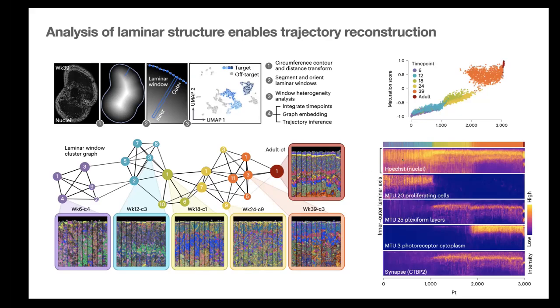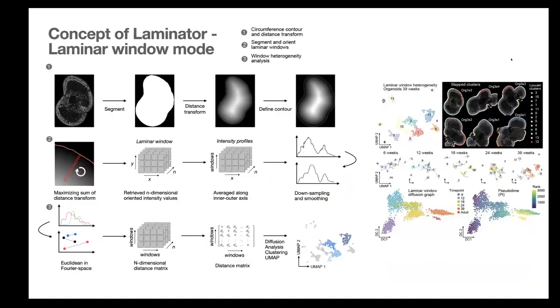In the beginning it's very disorganized, then over time it's really forming this double layer, the inner and outer plexiform layers of the retina. And if you put numbers on this, we can come up with a maturation score where we show that the later time points of the organoids are becoming closer in their composition of the laminar structure to the primary tissue, which are the red dots.